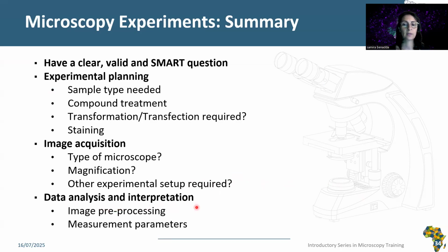You might need to consider modification, your data processing, how to analyze the data to get the answer to your question. How are you going to represent your data so that it will make sense to somebody that is reading your paper? It's very important to find your pipeline for all your experiment and data analysis.